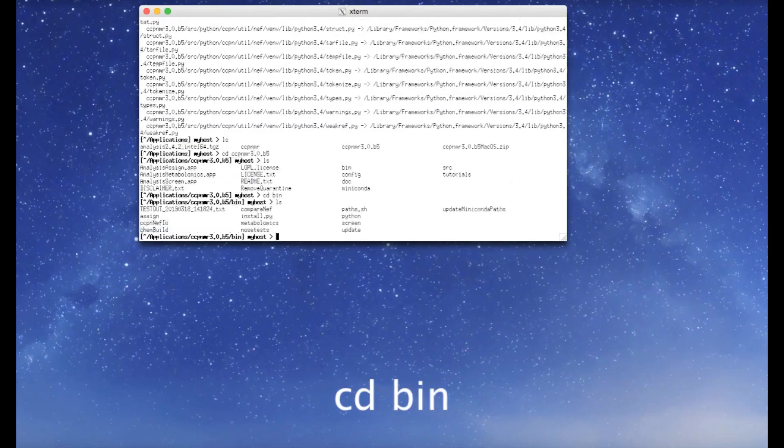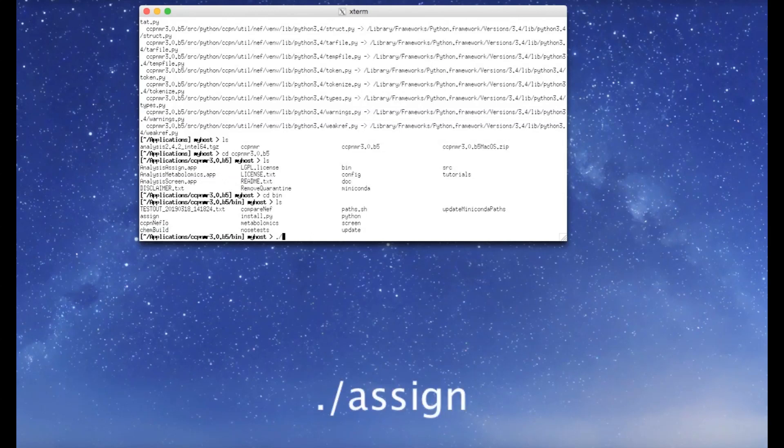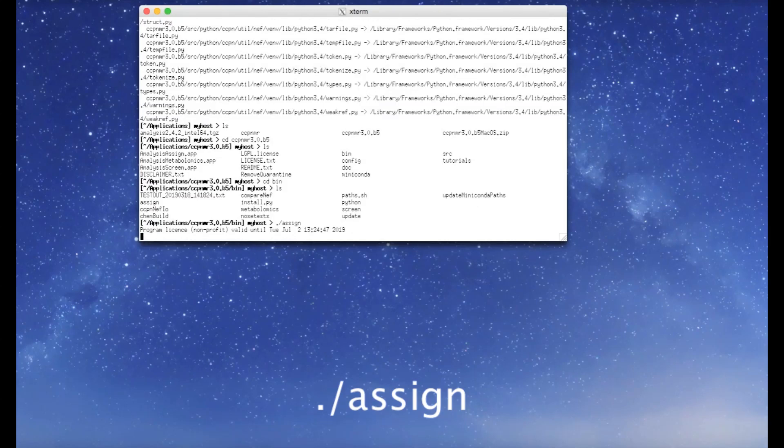And this is where all the executable files live. You can start the program simply by typing dot slash assign. It may take a little moment for the program to start fully.